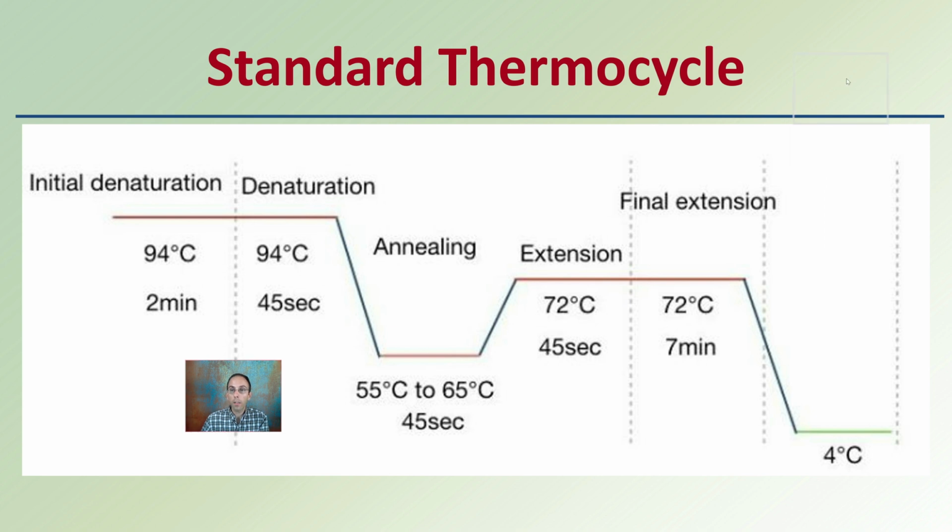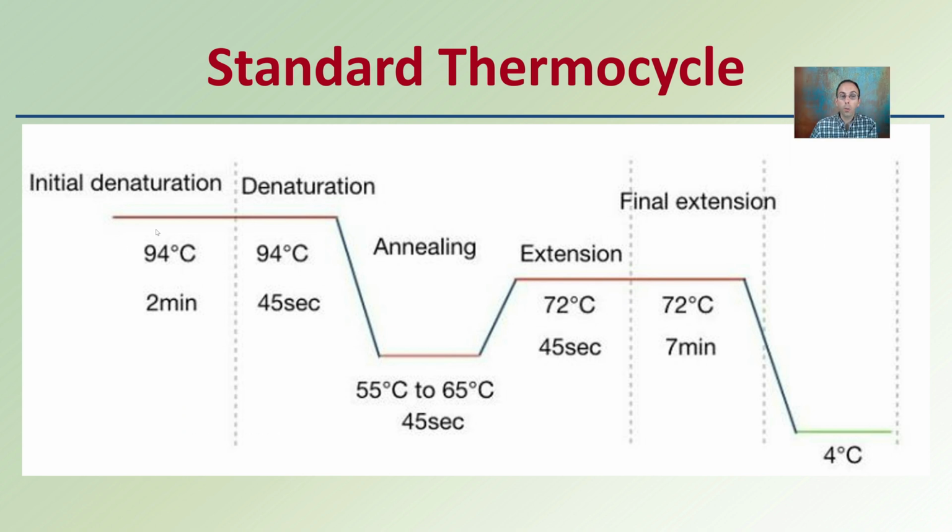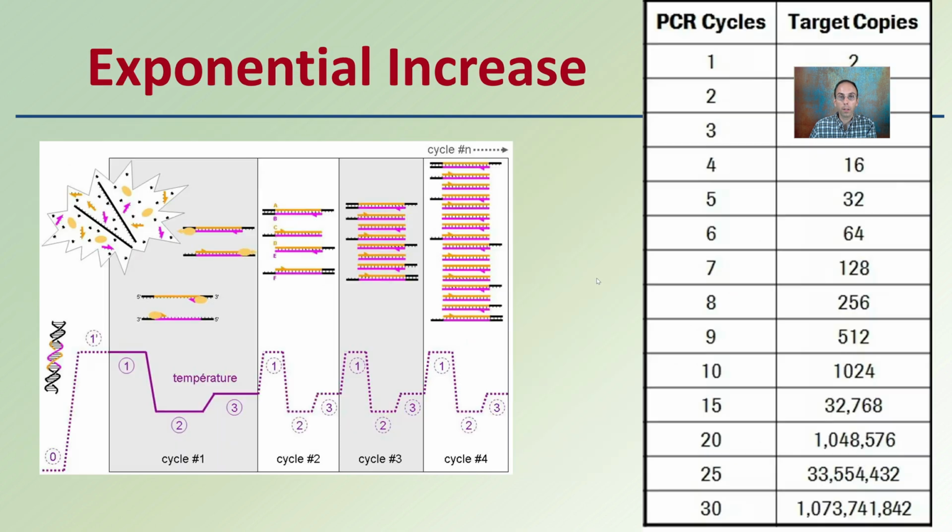So this is the standard thermocycle: as I said, 94 or 95 degrees to denature, for only about 45 seconds at that temperature. Then we cool it down for about another 45 seconds to allow those primers to anneal. Heat it up to 72 degrees Celsius for, again, under a minute, let the extension phase occur, and then repeat and repeat and repeat. At the very end, it will chill down to 4 degrees Celsius and hold there until you pull your samples out of the thermocycler.